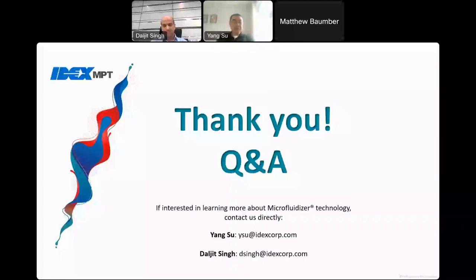I would say that's a good question. The quick answer is yes, at some point. In general, the system and the technology is able to handle a wide range of viscosity. We have seen some very high viscosity formulations. The pump is powerful enough to pump higher viscosity samples or product through the interaction chamber, the microchannel inside there, without any issue usually. I think the issue with viscosity is how you transfer the product from your inlet, either the reservoir or tank, to the system and collect it.